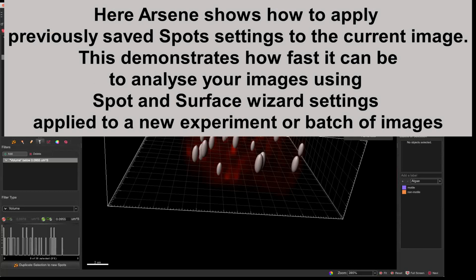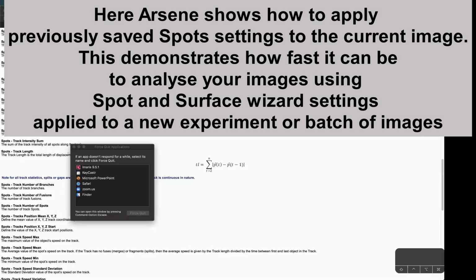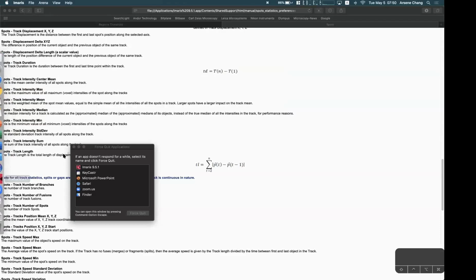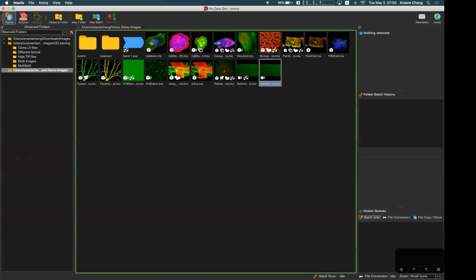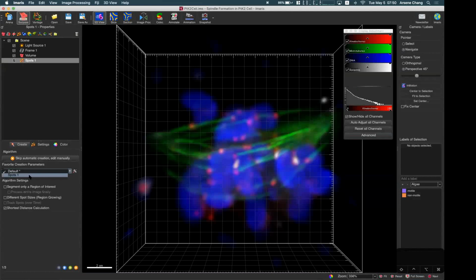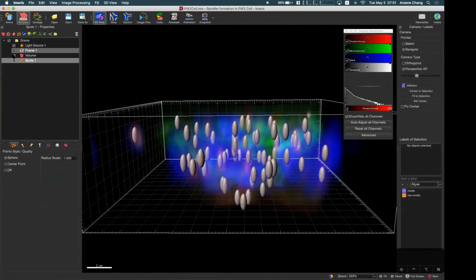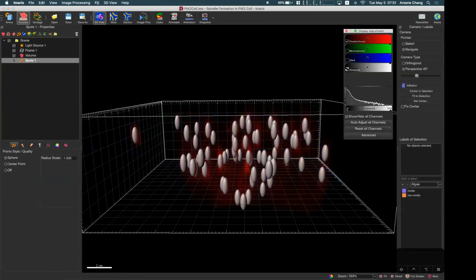All right, sometimes this happens. All right, so let me share the screen again. I guess now it's disappeared. All right, so let's go back. Let's go back to this one. All right, so here let me just reuse this again. And I click this green arrow to quick finish. So now I have the same result. All right, so let's continue.